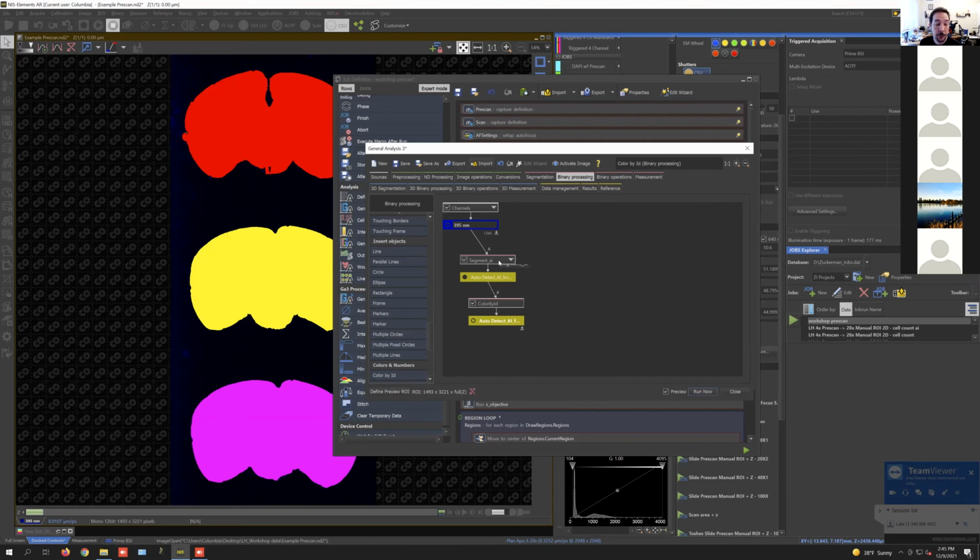If, for example, this didn't work as nicely as it just did, in here we have a few limited options we can use to make sure this output is a little bit cleaner. So maybe the AI is doing a good job, but not a great job, kind of like when I first showed you this at the beginning. Then you can use these additional tools, like smoothing the data a little bit, maybe put a size filter in.